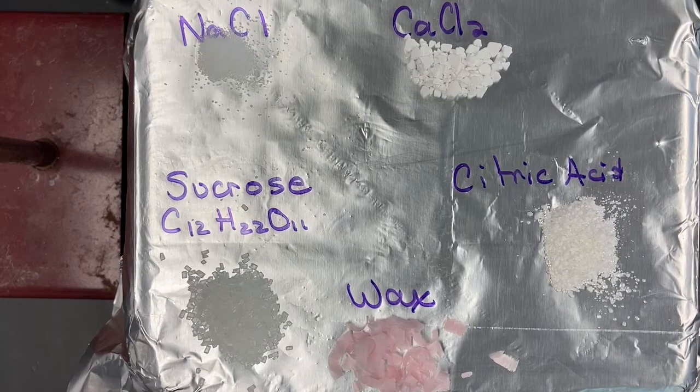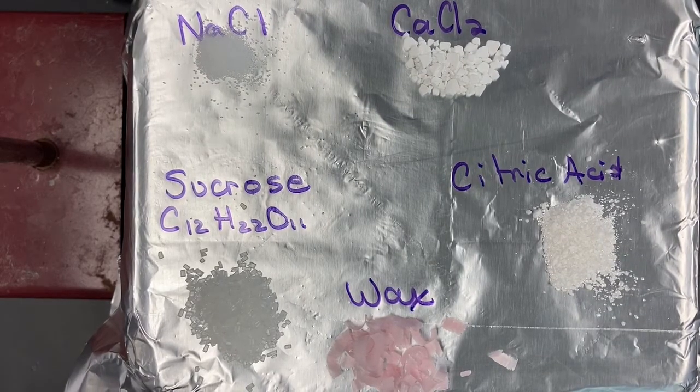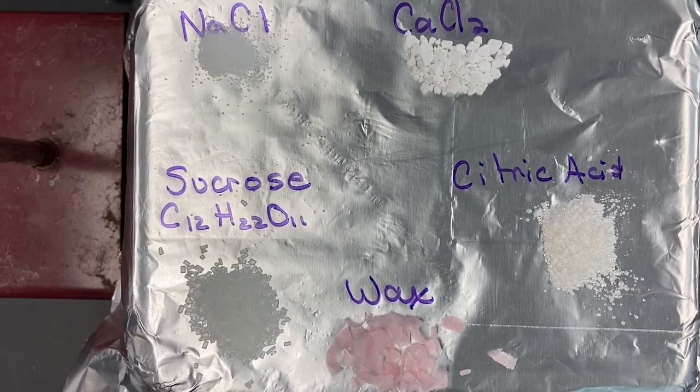We stop, and then what we're going to do is turn on the hot plate now, and you're going to rank them in order of melting point. Which one melts first, and then second, third, fourth, and fifth. So the hot plate has been turned on. Well, it's getting there. There we go. To high, and just watch and see what happens.